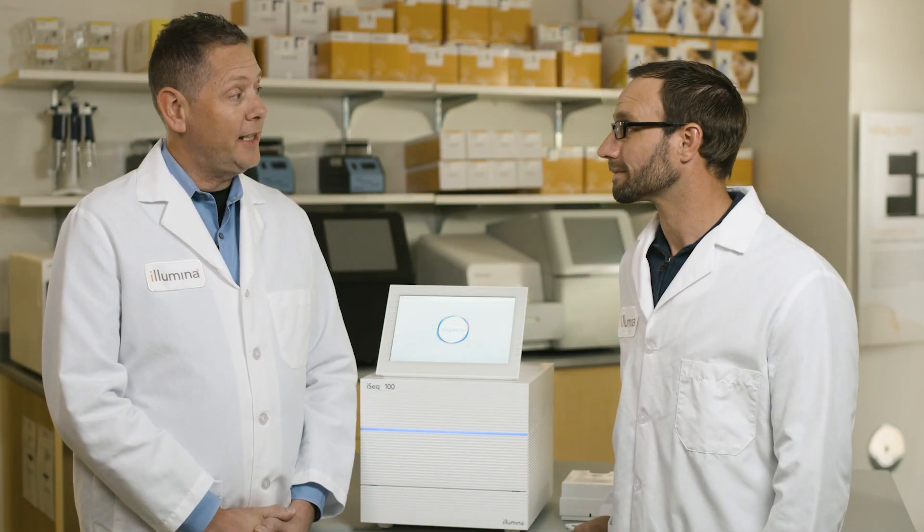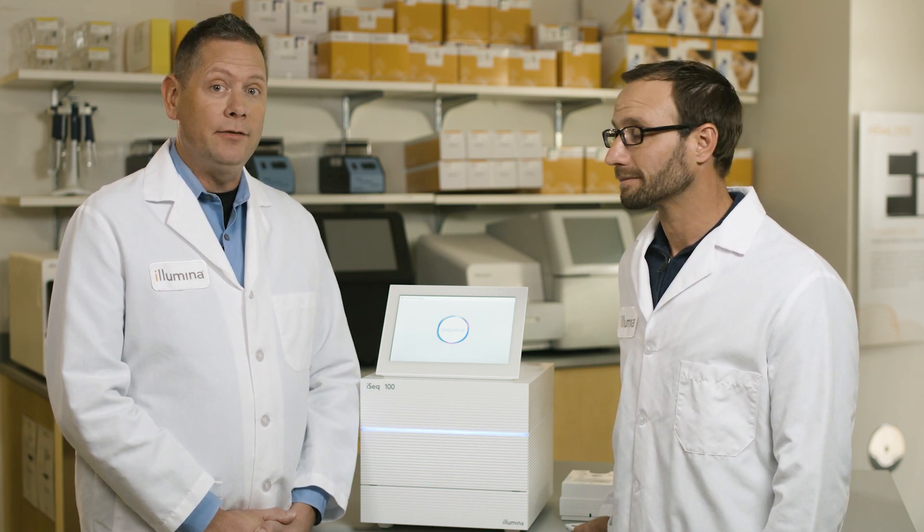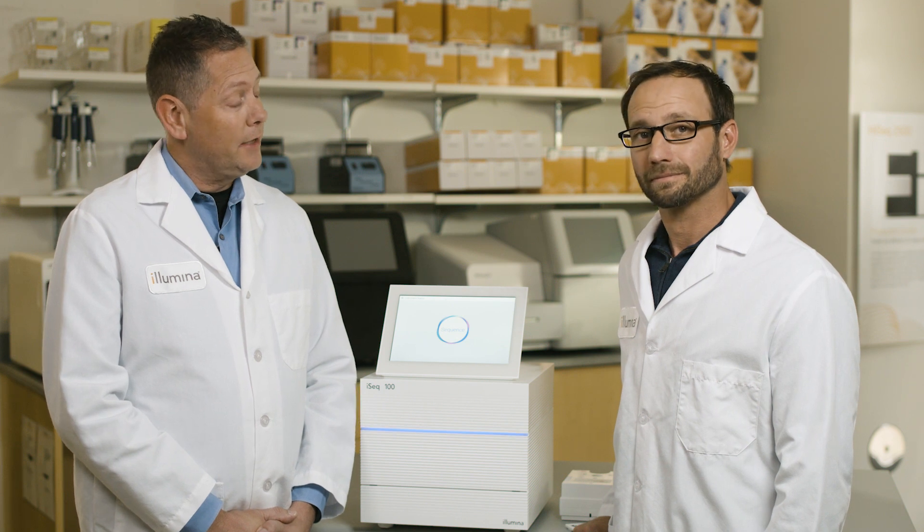Show us how easy it is to set up and begin a sequencing run. You can highlight some features of the consumables and the instrument itself and demonstrate what the workflow might look like for a typical run. Not only did our development team combine SBS chemistry and one-channel CMOS detection, but they also optimized the workflow by utilizing the cartridge-based reagent delivery system used by the MiniSeq, MiSeq, and NextSeq. This makes the process of setting up a run easier than ever.